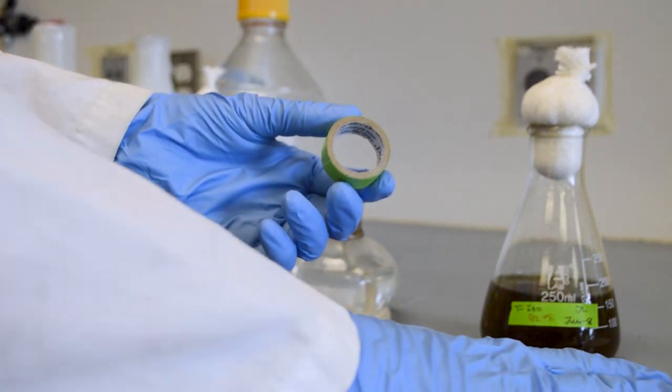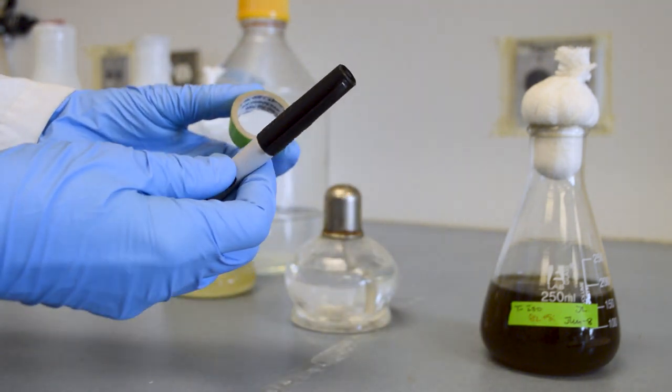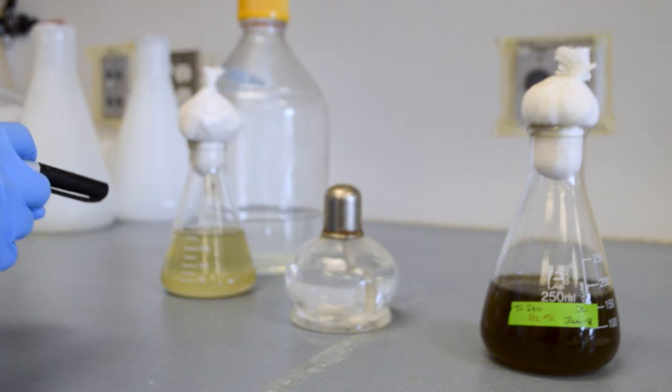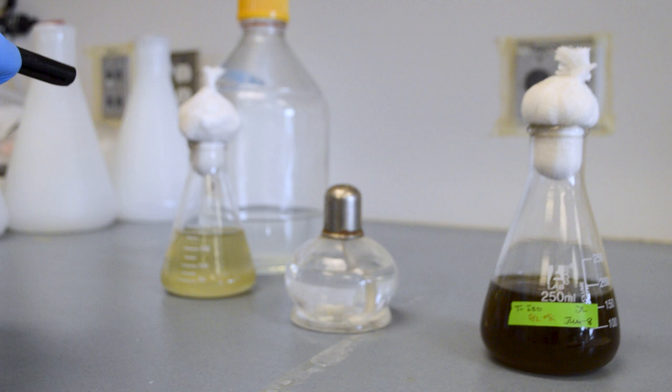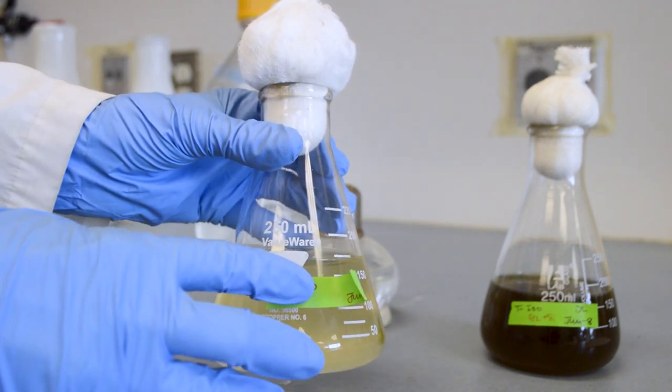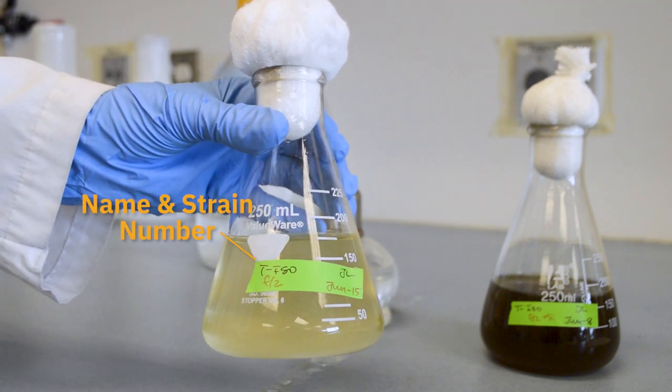Now we will label our new culture vessel. If you are transferring more than one species at a time, it is especially important to label your flasks before any transfers take place. Labels should include the species name and strain number, the type of media, the date, and your initials.